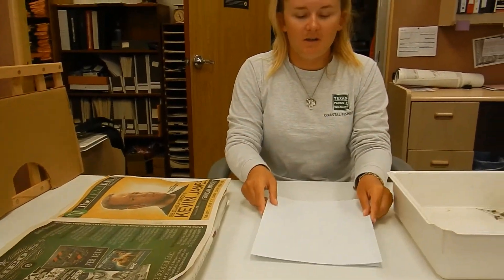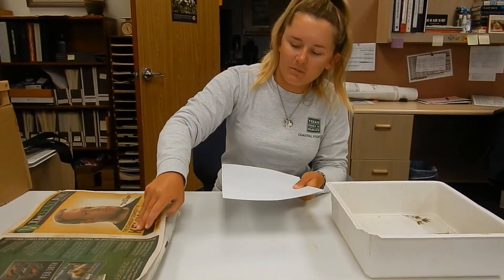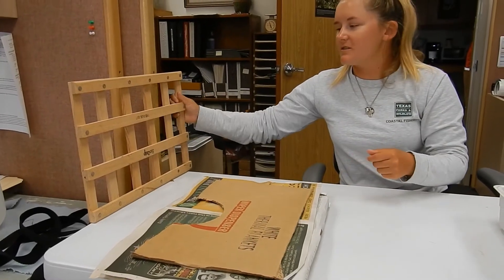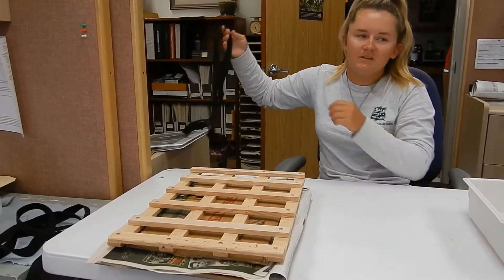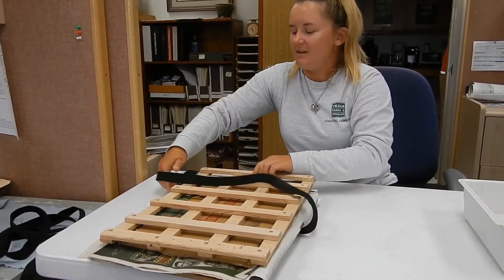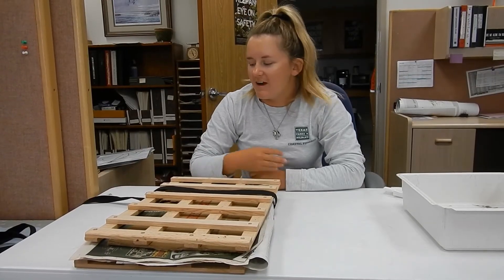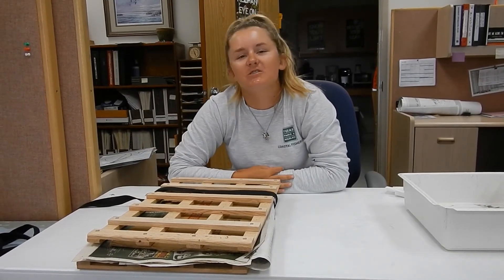First you're going to put a top piece of cardstock, then put it between the newspaper. Then we can start closing up the press by putting cardboard on top, and then you're going to put the strap around it and tighten it up. After you're done tightening, you're going to leave it in here for two to three weeks.